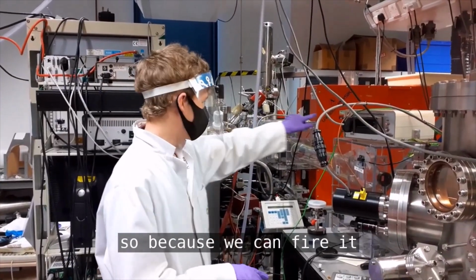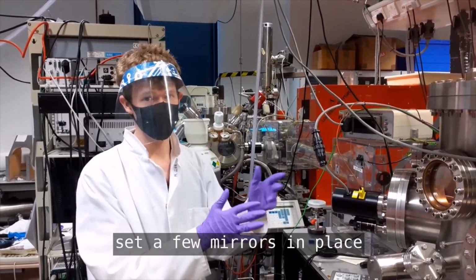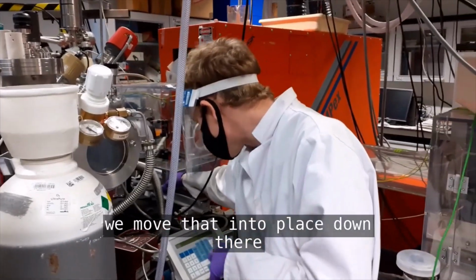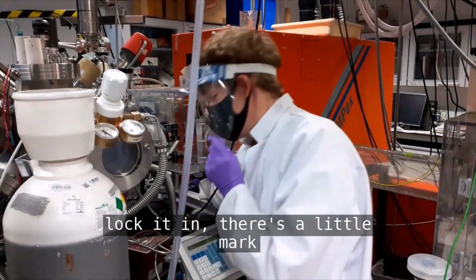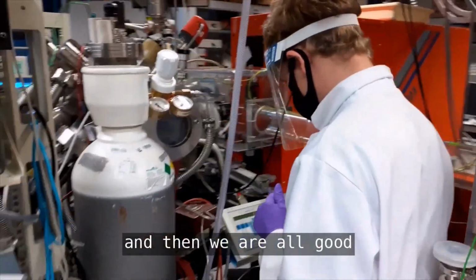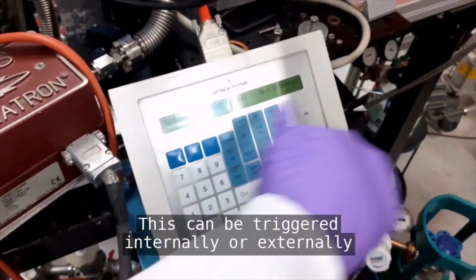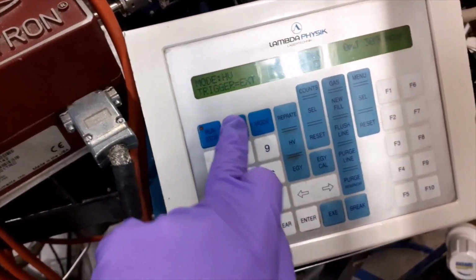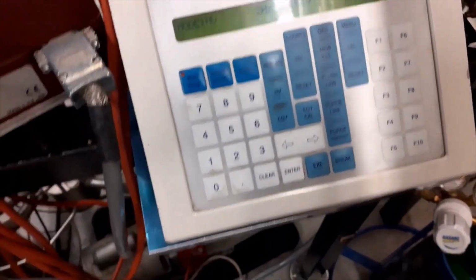Because we can fire this into any one of these four chambers, we need to first set a few mirrors in place to make sure that we're firing into the right one. Move that into place down there. Lock it in, there's a little mark on there that shows you where it needs to be. And then we're all good. So now we need to set the laser. This can be triggered internally or externally, and today we want internal. So trigger, and then internal, enter.